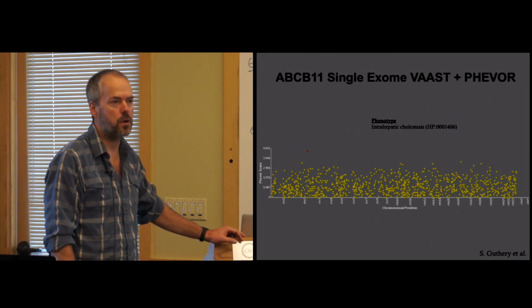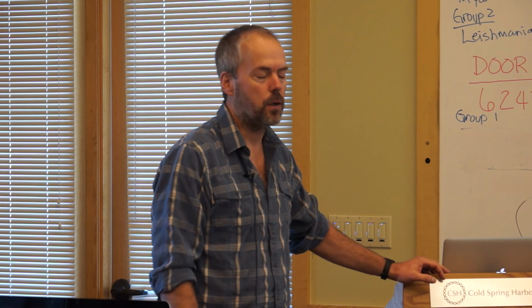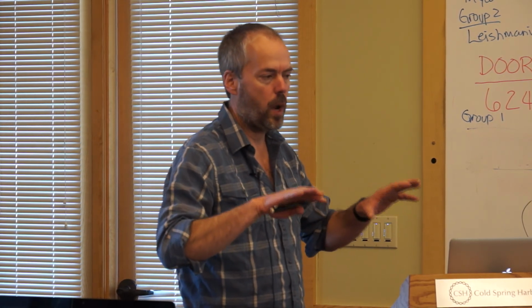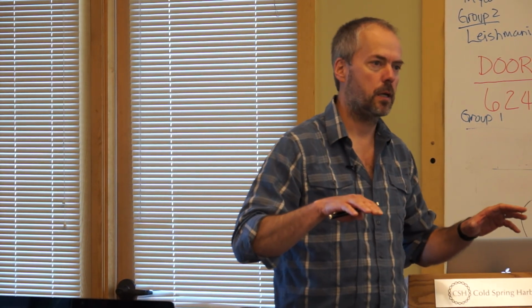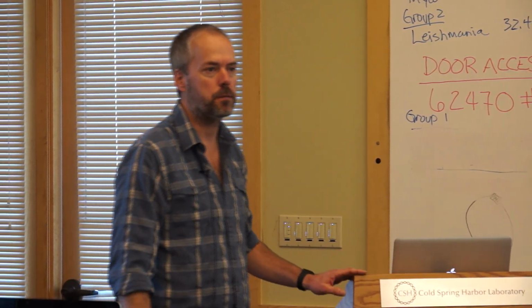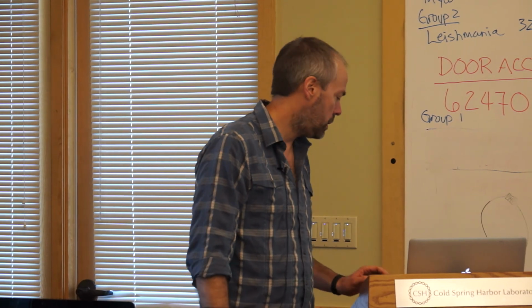We use that as a starting point, and often it's sitting down with the clinician and saying, okay, let's just look at this together. What terms would you describe this patient as having to begin with, and let's choose a set of terms that will weight all of the relevant parts of the ontology, but not scattershot it so much that we haven't really given ourselves any resolving power at all.